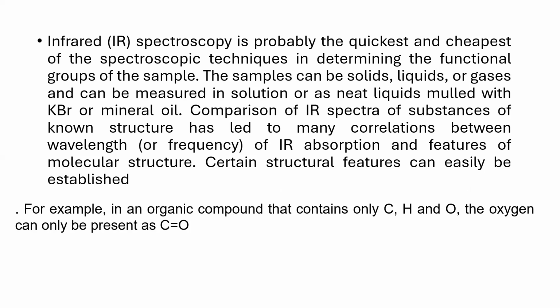Second is you can analyze the structure of molecules, whatever may be the form of the analyte, may it be solid, may it be liquid or gases. Of course, the methods are going to vary when we apply the sample to the instrument. If it is gas, how do we go? If it is liquid, how do we go? And if it is solid, how do we go? That will differ. But yes, you can analyze all different types of substances using this.